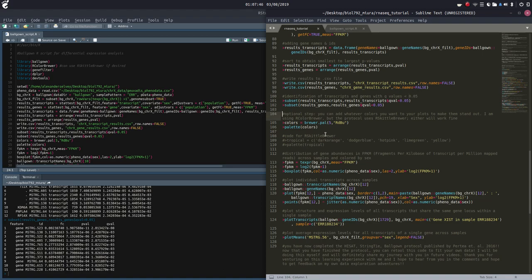So in the protocol, this is an optional step — you can add whatever colors you want to your plots to make them stand out. I'm using RColorBrewer, but the protocol uses RSkittleBrewer. Either will work fine. If you're going to use RColorBrewer like me, to install RSkittleBrewer I would have had to compile from GitHub. Since RColorBrewer was already installed, I decided to use that.